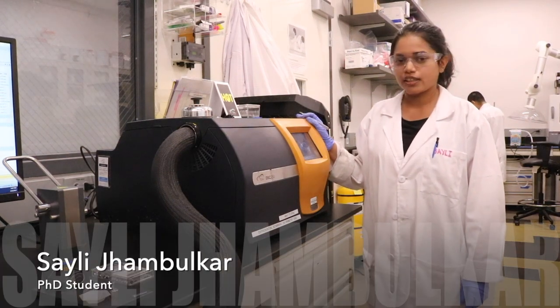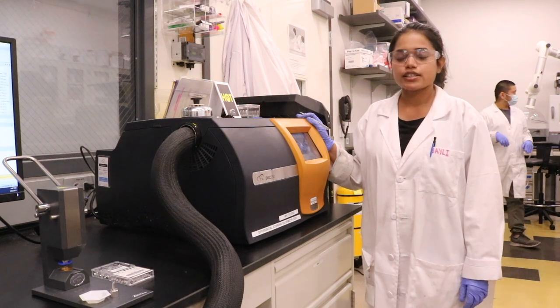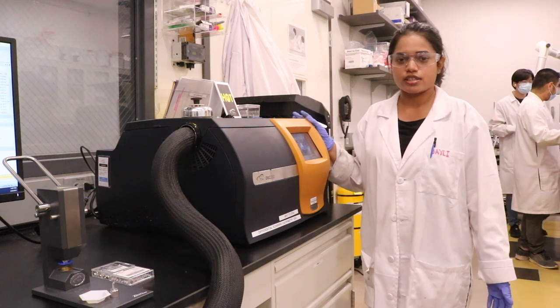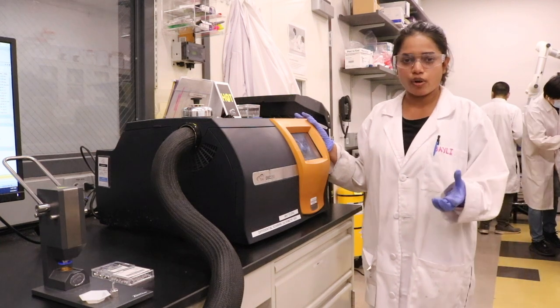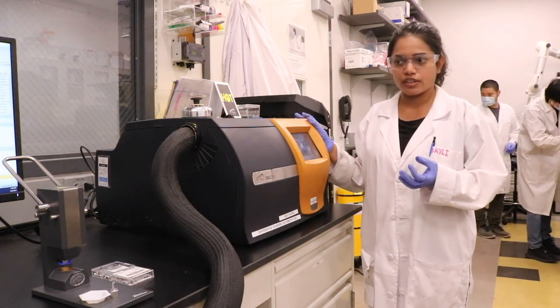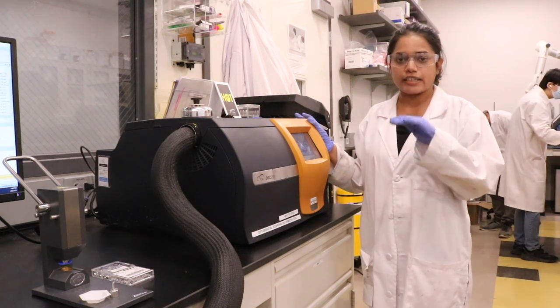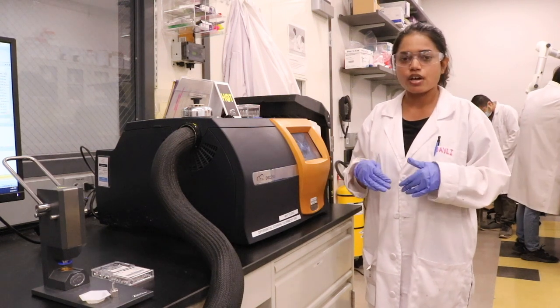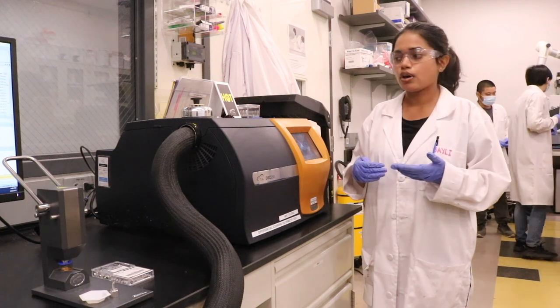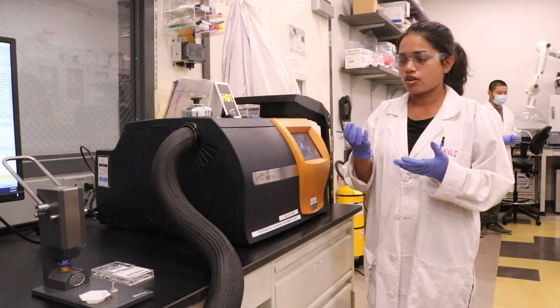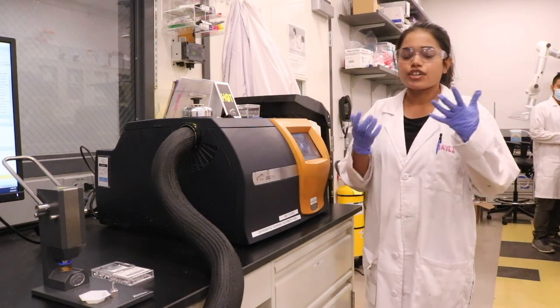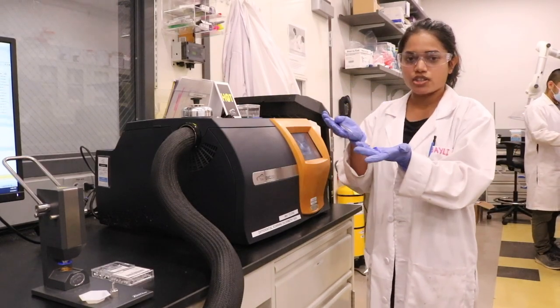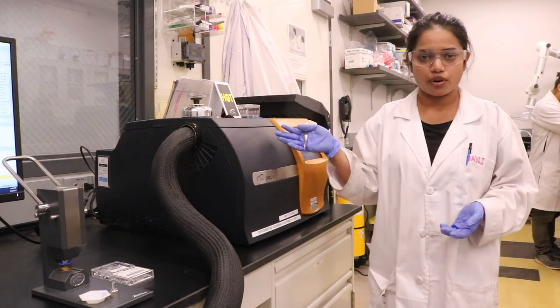Hi guys, this is a DSC instrument. It's a differential scanning calorimetry instrument. It is used to determine the thermal phase transitions that take place in a polymer. For that, we heat the polymer sample as well as the reference sample together to maintain constant temperature throughout the test. In some cases, a polymer undergoes exothermic or endothermic reactions. So depending on that, we need to increase or decrease the temperature with the addition or subtraction. That heat flow versus temperature or the thermal transitions with respect to temperature is determined from this instrument.